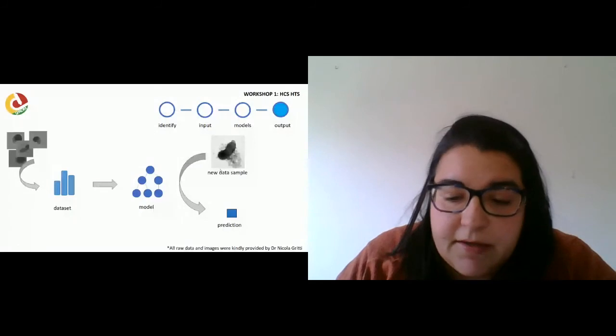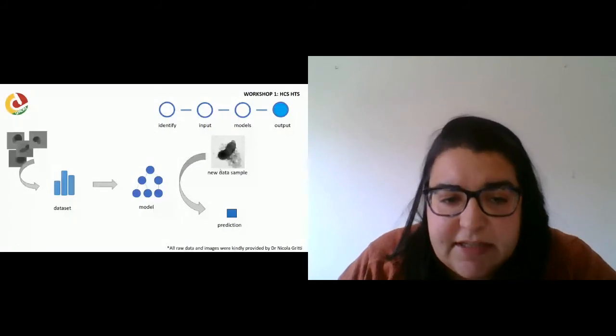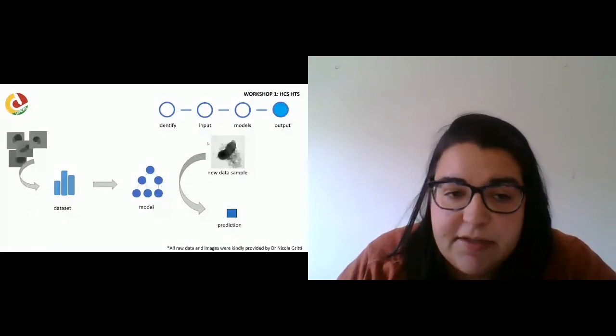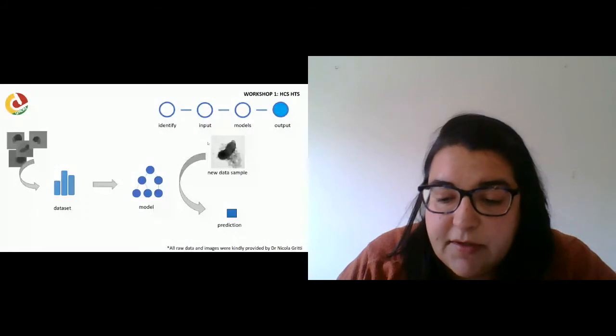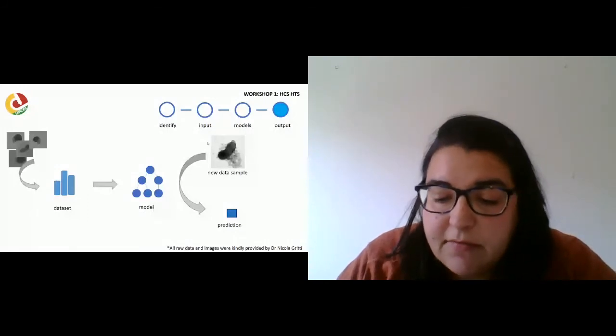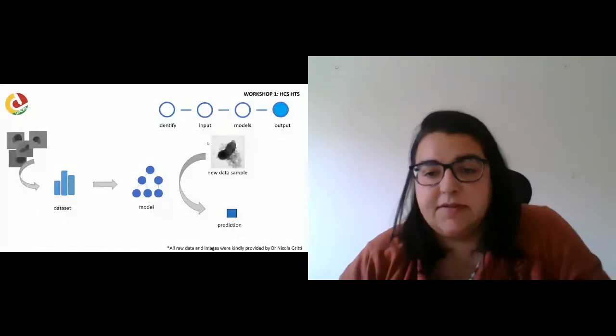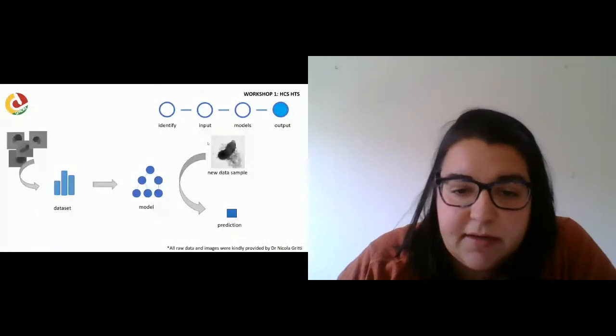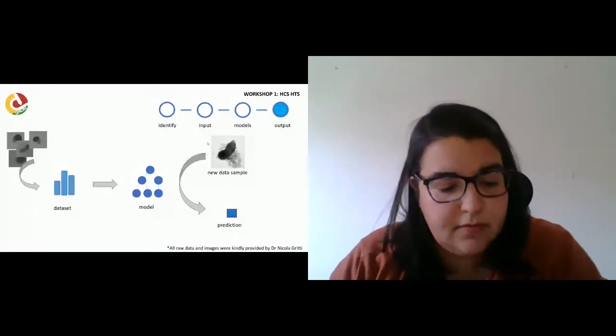And to obtain a good evaluation of the process, it's necessary to have another data set for testing. Okay? In our case, we are going to use the first data set for training the model, and the second one, the time-lapse, for testing. So this is the software that I want to show you.